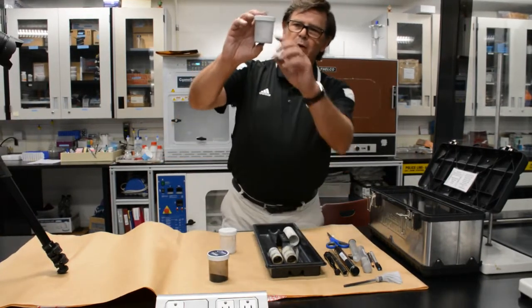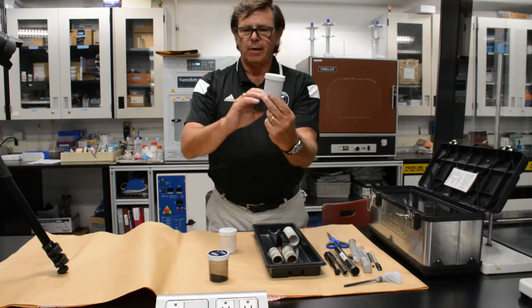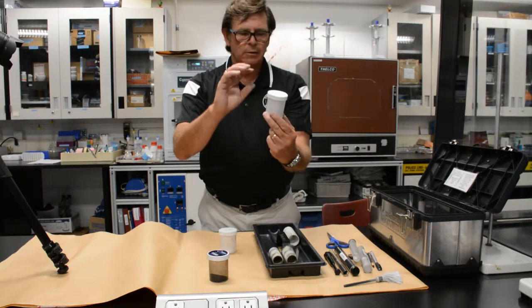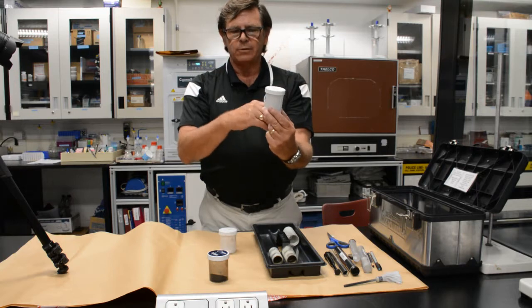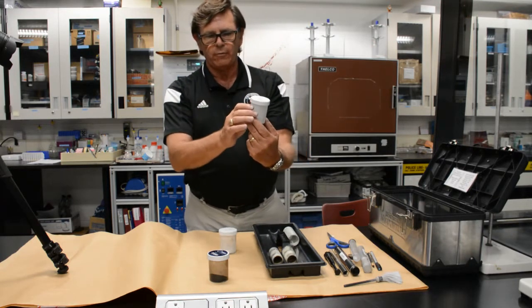So that was one of the reasons why the powder is a minimum quantity in there, to allow a headspace so that you are able to spin off the excess powder from the brush without actually doing it in the air. You can do it in the jar, more of a controlled environment.